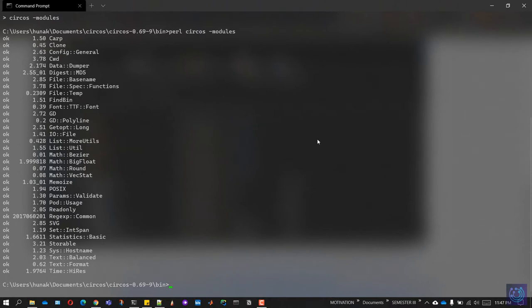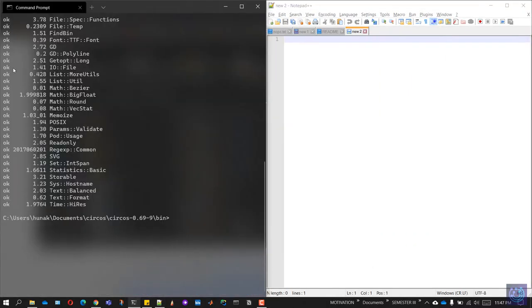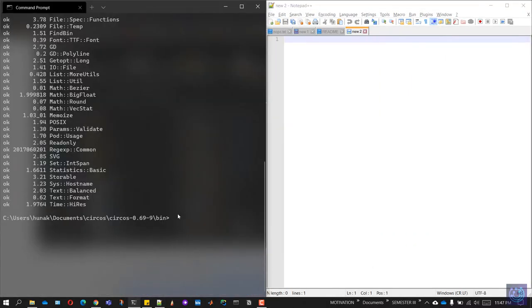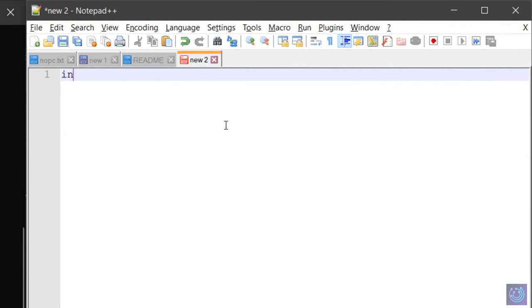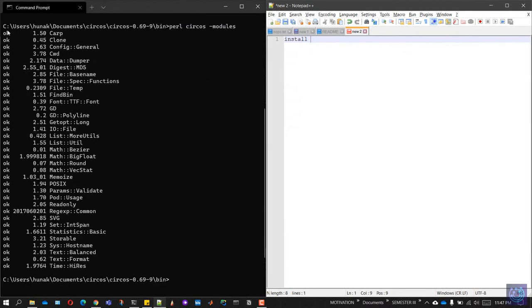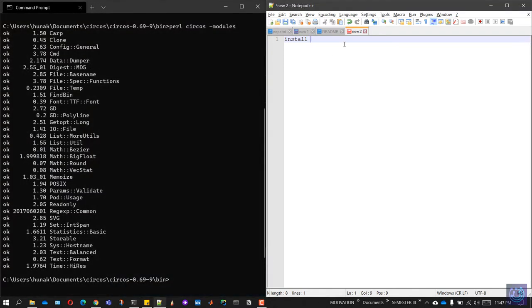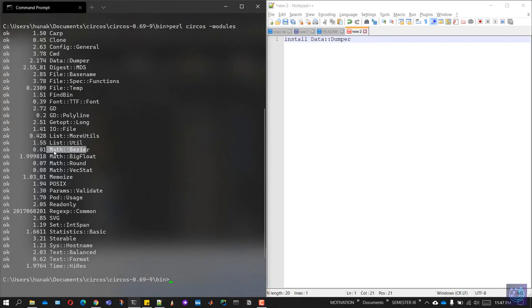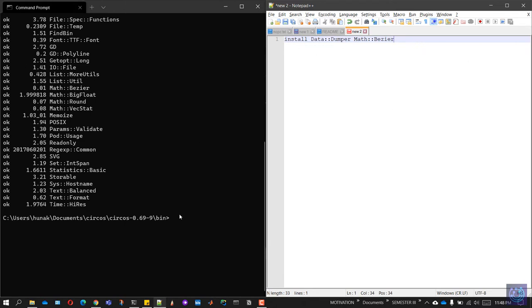To make it easier, first fire up a notepad and type in install space, and all the modules which have missing in front of them. For example, if Data Dumper is the module which is missing, copy this and paste it in the notepad. Do the same for all modules which have the tag missing adjacent to them. Paste them after adding a space, one after the other in the text file.